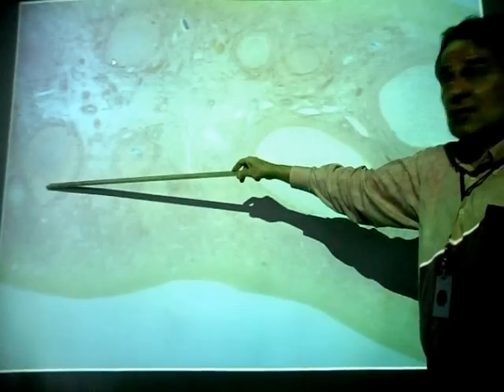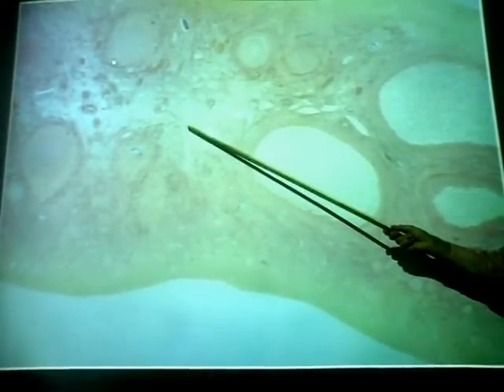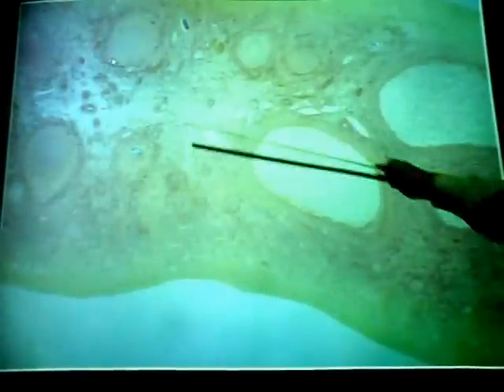Now, there are 3 types of follicles you should be able to identify: primordial, primary, and secondary. So let's take a look at them. First, let me just go back. Now, the 2 regions of the ovary, which you can see here very nicely. The outer region, where the follicles are developing, is called what? Cortex. The inner region here, full of blood vessels, nerve fibers, and such, but no follicles, is the medulla. So follicles are here in the cortex.